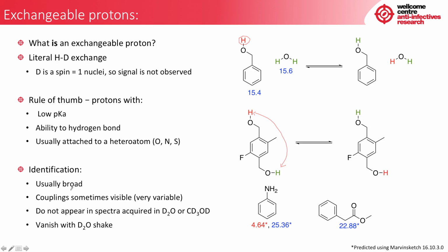The rates vary differently over the pH of your solvent. It can also be concentration, solvent, and purity dependent, and this means that some features like the appearance of coupling are actually quite variable, sometimes even for the same molecule.